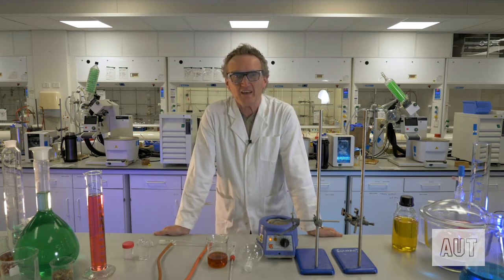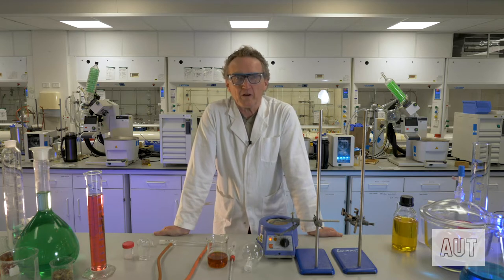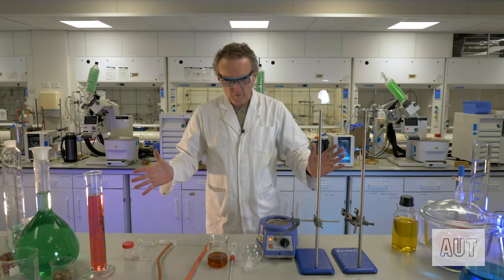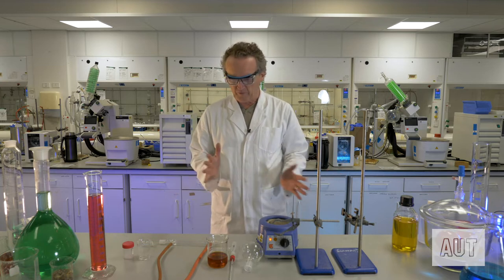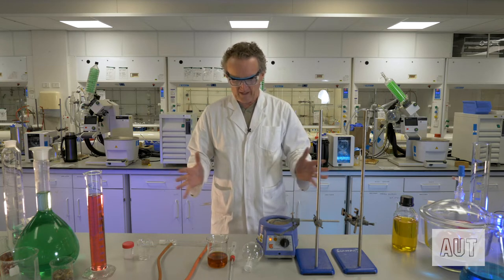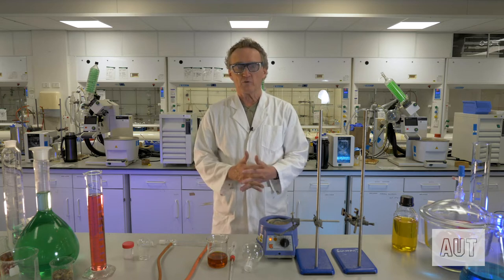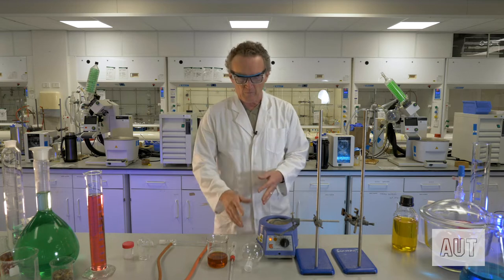And in the lab today, we are going to set up a distillation. And that's always fun, getting to put quick-fit glassware together. It's a bit like chemistry Lego, in a sense. So, before me, we have all of the material that we're going to be using. And again, this will probably be very much like what you are given when you get into the lab to do one of these experiments. So let's just go briefly through all of the glassware and then we'll go putting it together.